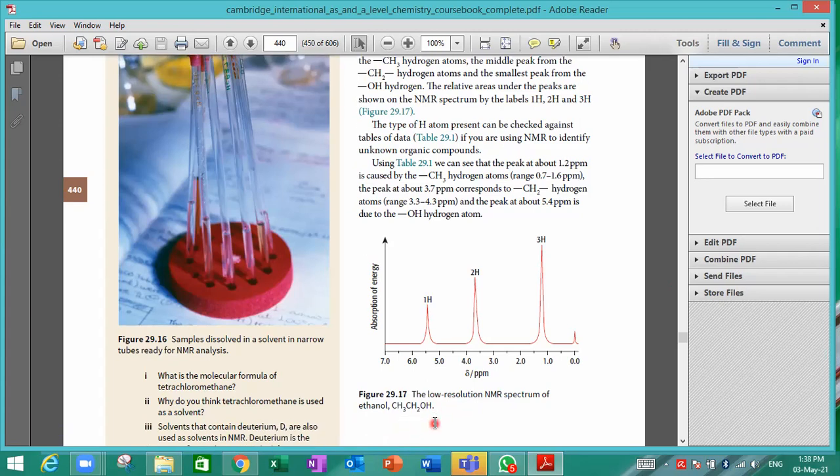It means that every hydrogen is bonded to a carbon or bonded to an oxygen that is different than the other. So these 3 hydrogens together, they are symmetrical, they are equivalent. So the 3 of them will get only 1 peak here corresponding to 3 hydrogen atoms.